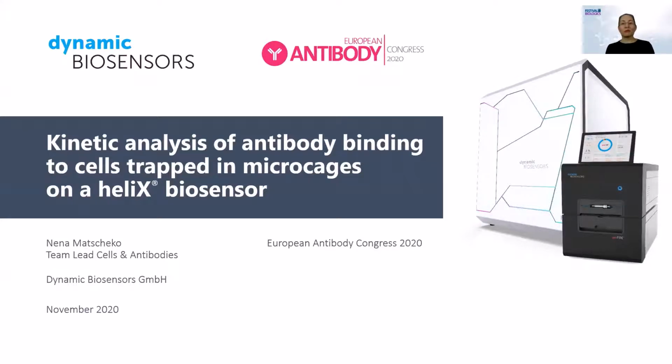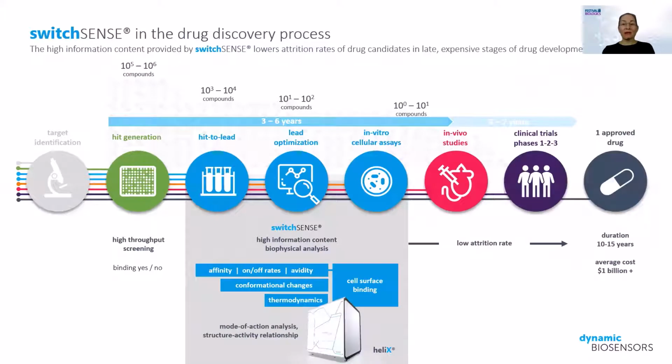Welcome everyone to this presentation about antibody binding kinetics measured by the newest tools of the switchSENSE technology. I'm Nena Matscheko and I'm heading the Cells and Antibodies Research and Development team at Dynamic Biosensors. Dynamic Biosensors has developed the proprietary switchSENSE technology.